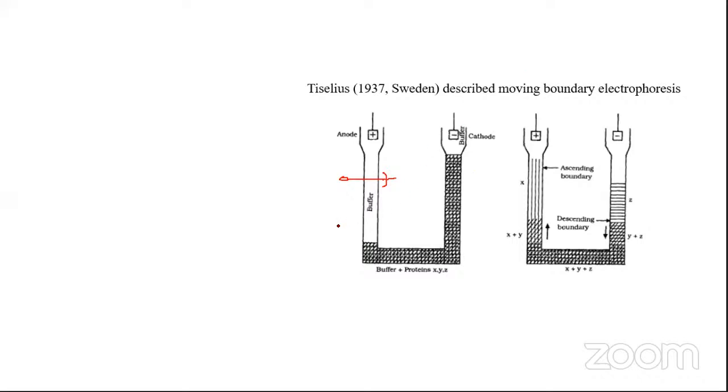Okay, fine. Now moving ahead from this point, there are certain things that perhaps were neglected by Tiselius when he was designing the moving boundary apparatus.